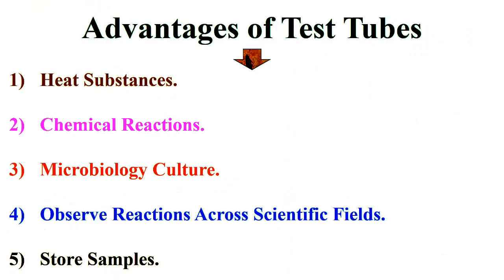Therefore, test tubes are used to heat substances, for chemical reactions, microbiology cultures, observing reactions across scientific fields, and storing samples.